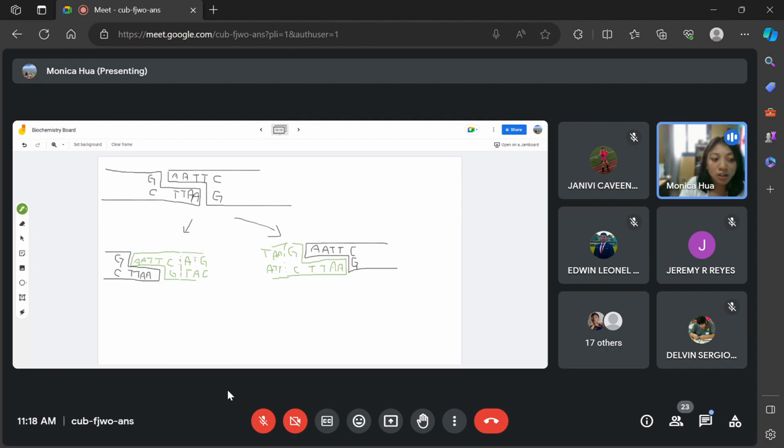And so for PCR, the first thing to do is to design these primers, right? We need to design the primers so the primers will stick onto the DNA sequence on the plant's chromosome, and the polymerase will be recruited to that specific sequence and copy it. That's why you need a forward and reverse strand, to tell the polymerase exactly where you want the sequence to be copied, and copy that over and over through PCR.